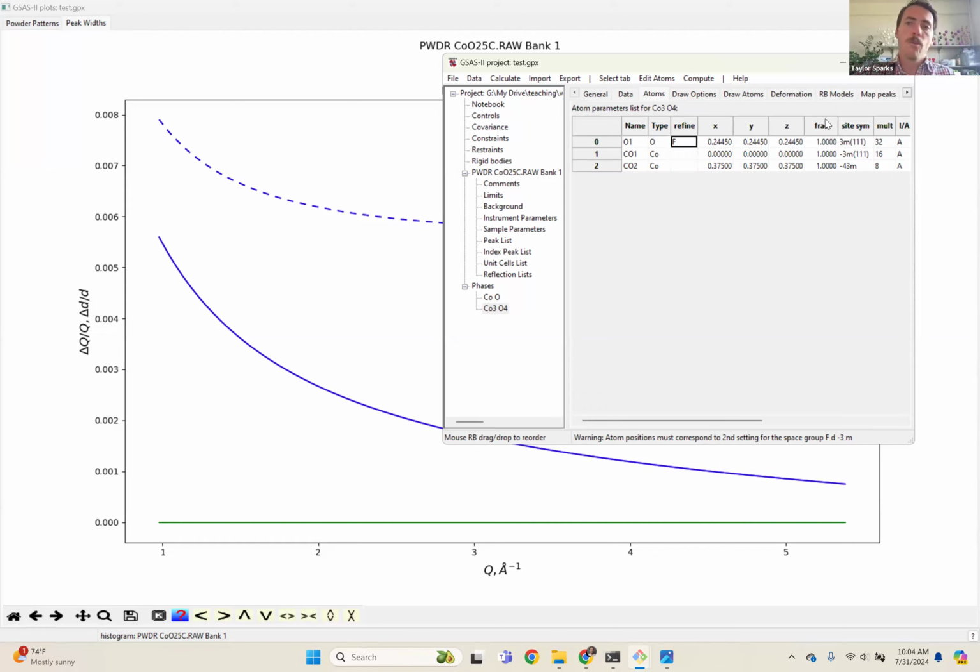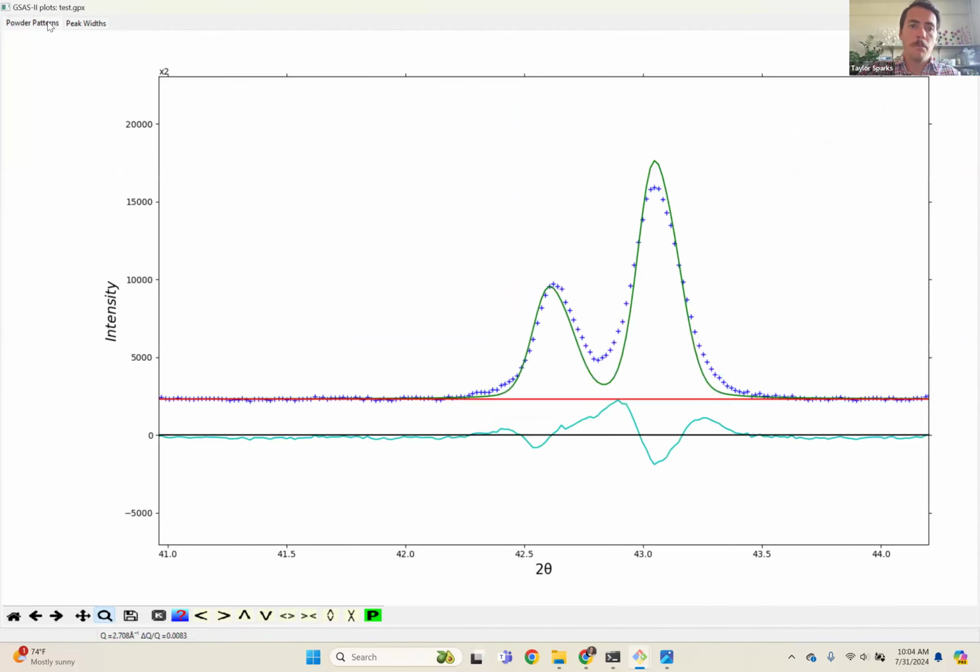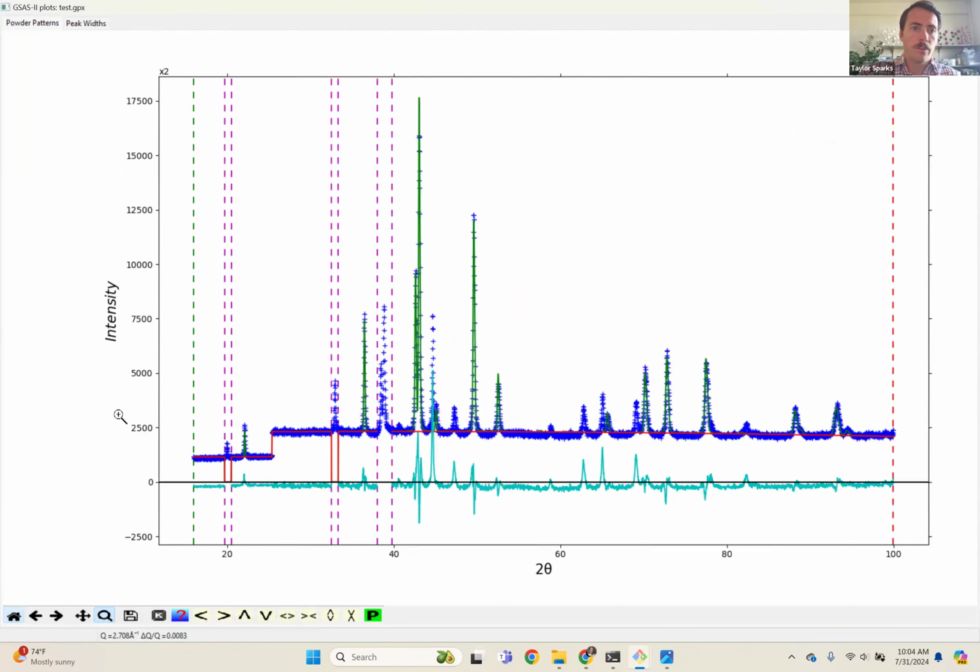As before, anytime that you're looking at this crystal structure specific level information, you have to have good data. It will always refine, right? It's always going to run, but whether that's a meaningful observation or not depends on whether you have good data. Here we have our signal to noise ratios, almost 20,000 to, well, ish 15,000 to 0, which is pretty good.